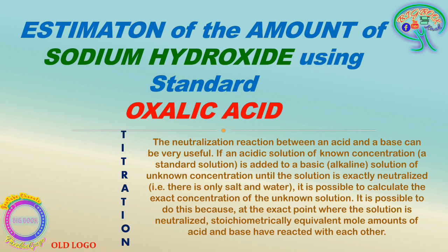Today we are going to discuss in these slides a new topic, a lab practical, that is estimation of the amount of sodium hydroxide using oxalic acid. It's a titration method. Before getting into these slides in detail, we will just go through the definition of titration.